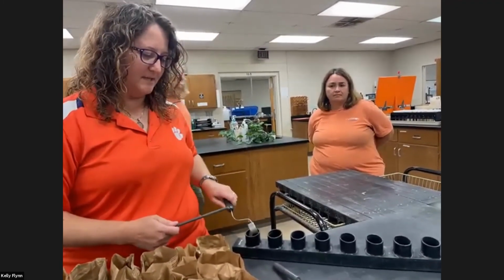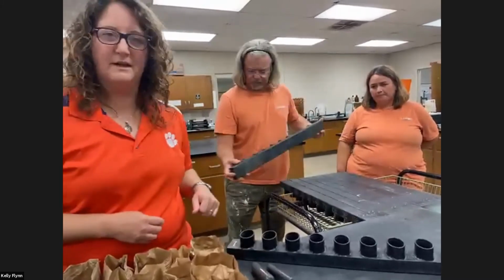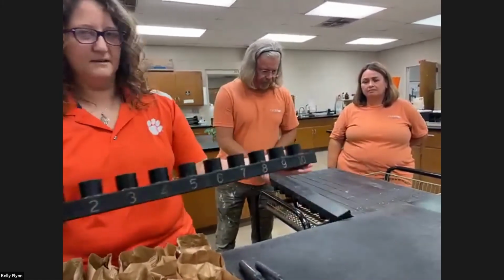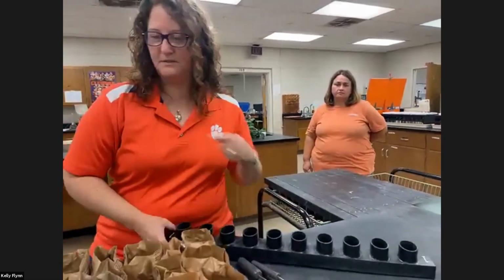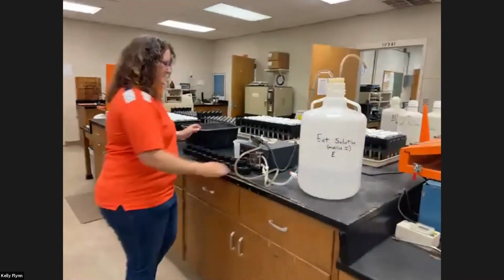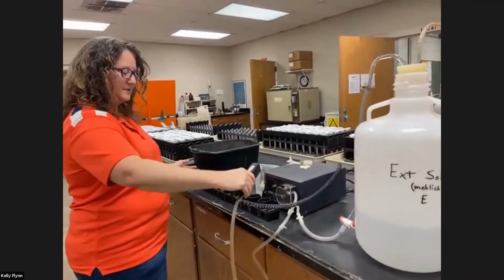So anyway, we're going to dispense that into a cup, and then I would move along for every single sample for the nutrient analysis, but I'm not going to do that right now. You can see the numbers on the cup system. Once we've gotten these full of our soil samples, we're going to add extraction solution. So I'm going to walk over here and show you this setup. We've got an automated dispenser for our extraction solution, which I'll tell you a little bit more about later. But anyway, if I had 100 samples, I would dispense liquid into each of these cups.